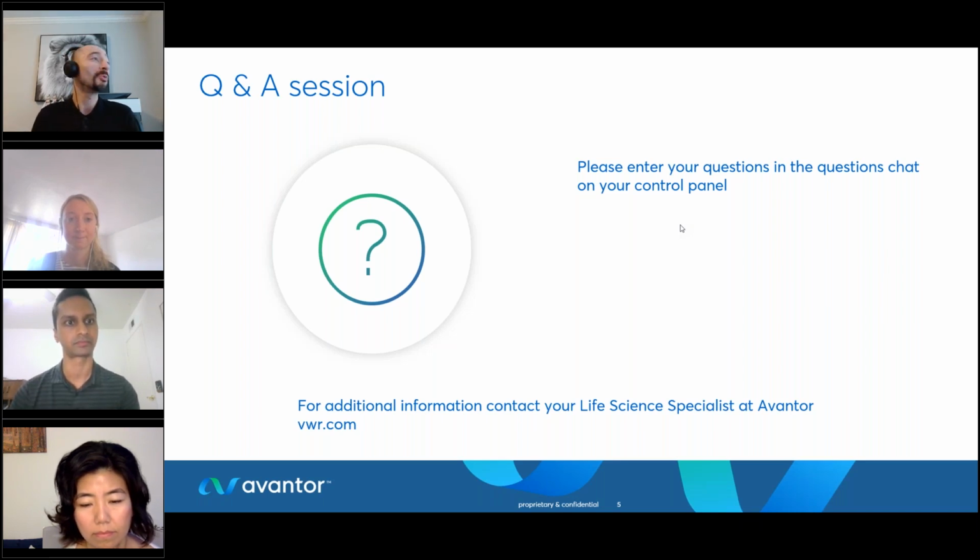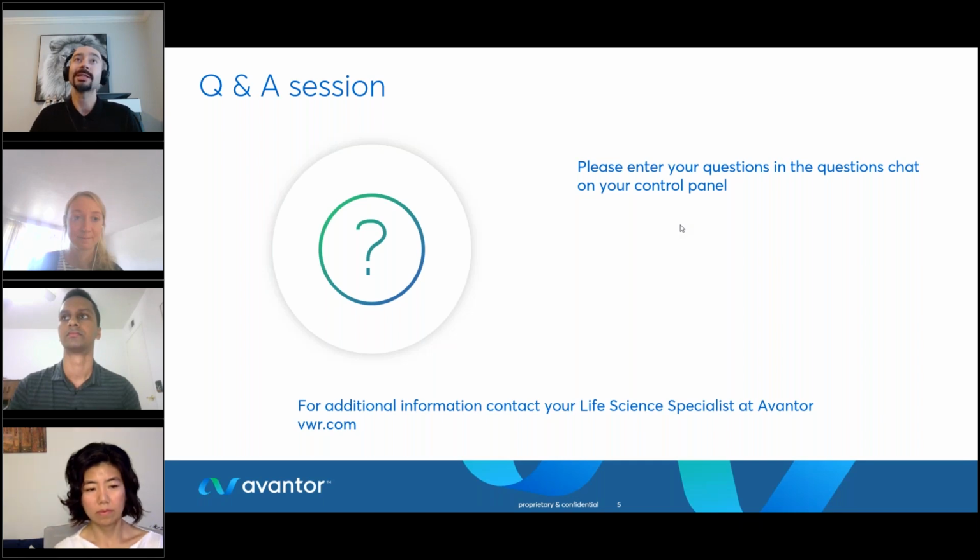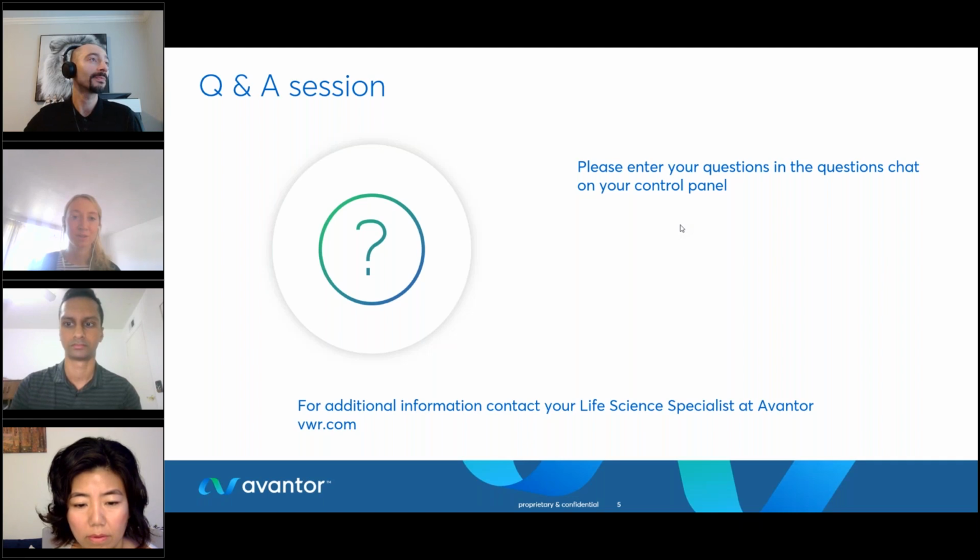Thank you. Moving to you, Sarah. When we talk about the real-time data analysis, can the Epitome software give us sequence data even when the sequence run is running actively? So currently the clone validation workflow isn't set up to do that, but we do have some other workflows in the Epitome infrastructure that do support that. And if it's of interest to the community, then it's something that we could think about adding, certainly.